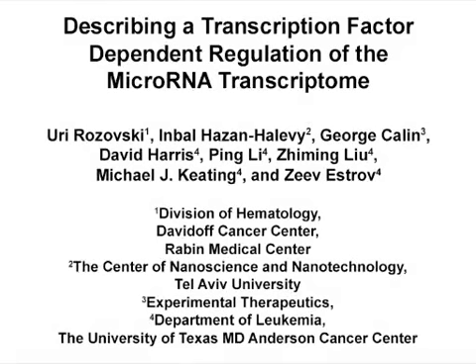The overall goal of this methodology is to describe how a transcription factor of interest regulates the microRNA transcriptome. This method can help answer key questions on whether transcription factors that modulate transcription of protein coding genes are also involved in transcription of microRNAs.